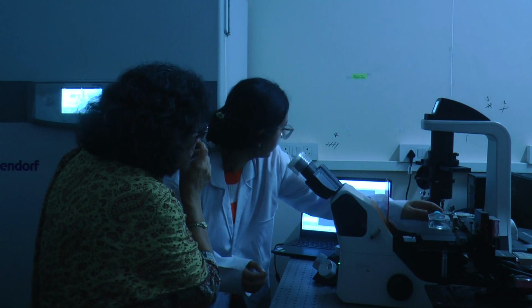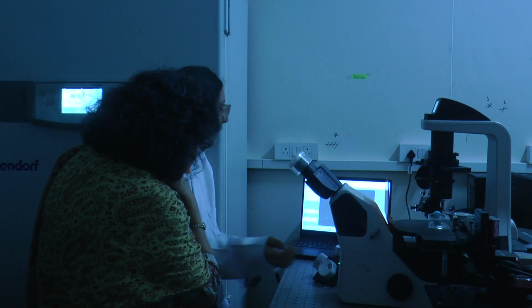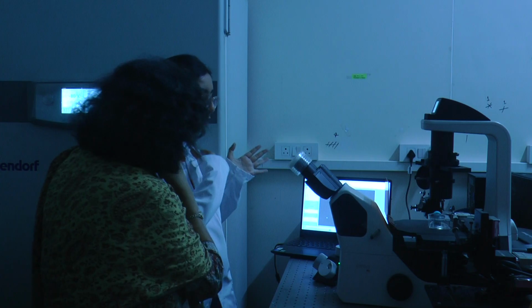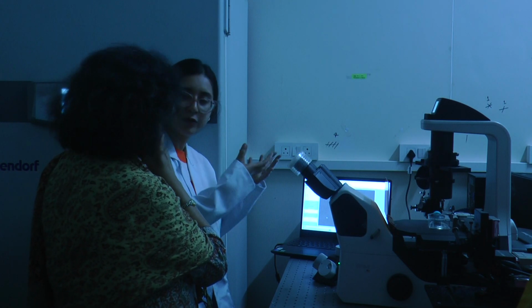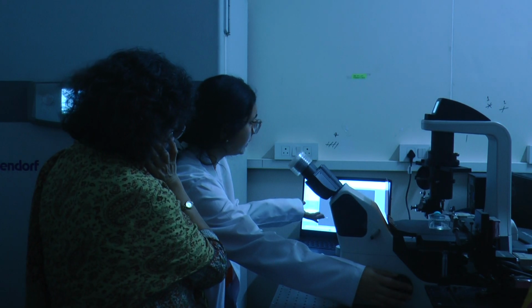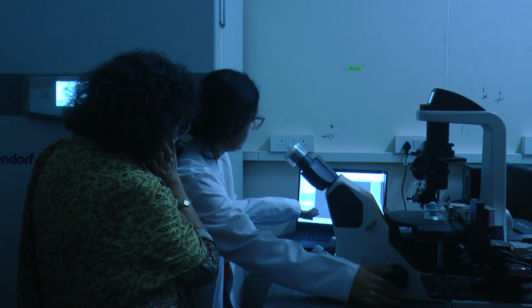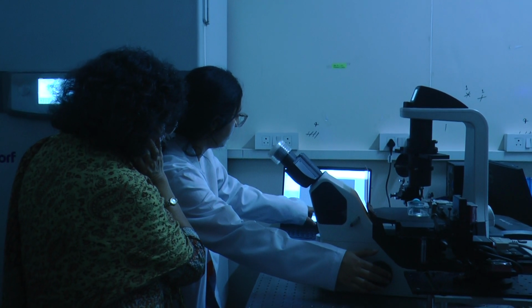So does it need more time of incubation? Yeah, actually, if you leave it for however long, at least some will always be budding out. But we can see the density in the solution. If we feel it is less, we can give them more time. Yes. These all are best.